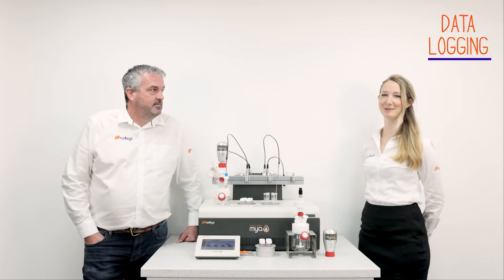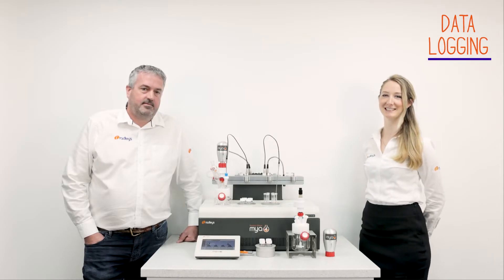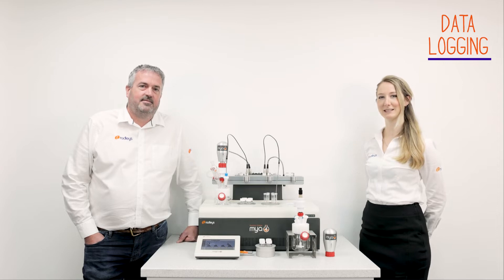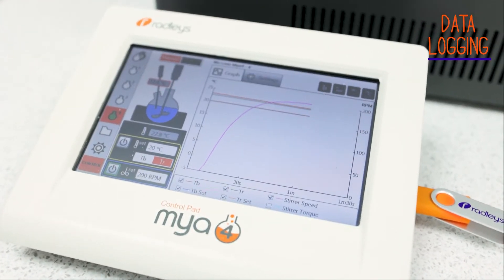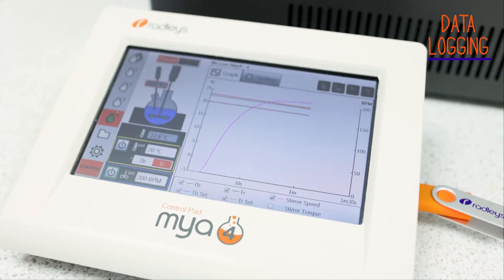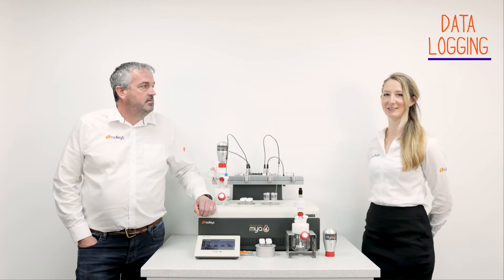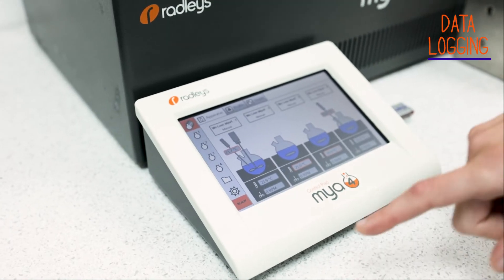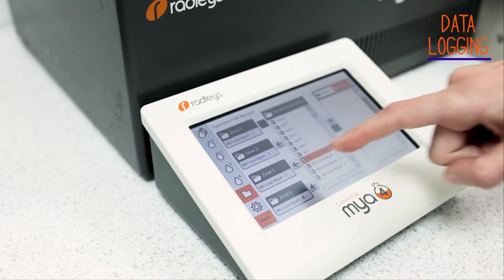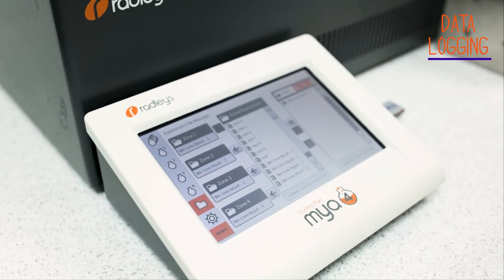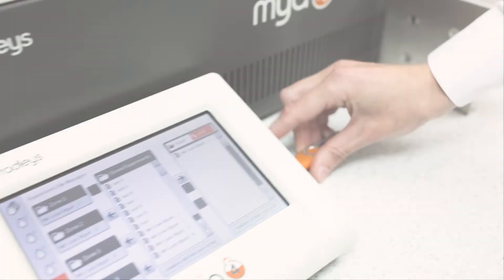Let's not delay and get on with the first reason: data logging. So to be information rich, data is key. The Maya 4 automatically logs the data that your experiment has generated. You can control and monitor your reaction parameters like your stirring, your temperature, and even your pH. This means that you eliminate any opportunities for error if you're recording everything manually, and it also means that you can send all that information to one of your colleagues.